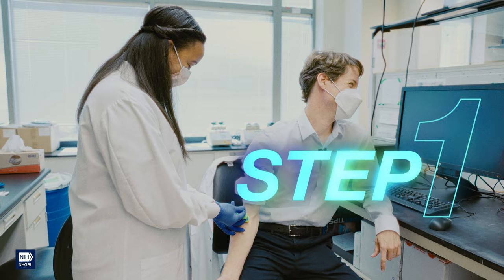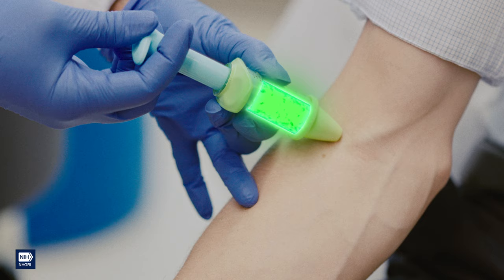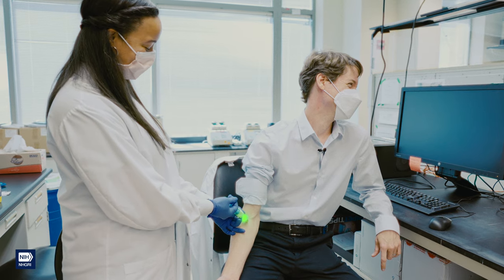Step 1: Find a DNA sample. For our project, we used a special type of cell that can multiply many times and make lots of DNA. But you can use a more simple sample — blood works fine.